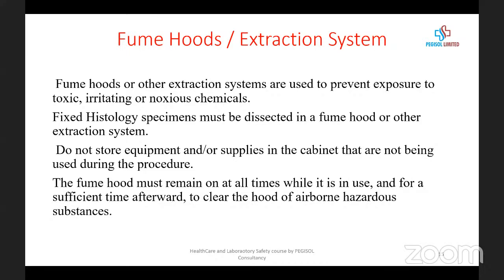For example, when we talk about histology, specimens must be processed in fume hoods or other extraction systems. This will help to protect the laboratorian, the pathologist, the physician, or whoever is working with the histology specimen. Do not store equipment and other supplies in the cabinet that are not being used during the procedure. The fume hood must remain on at all times while it is in use and for a sufficient time afterward to clear the hood of airborne hazardous substances.